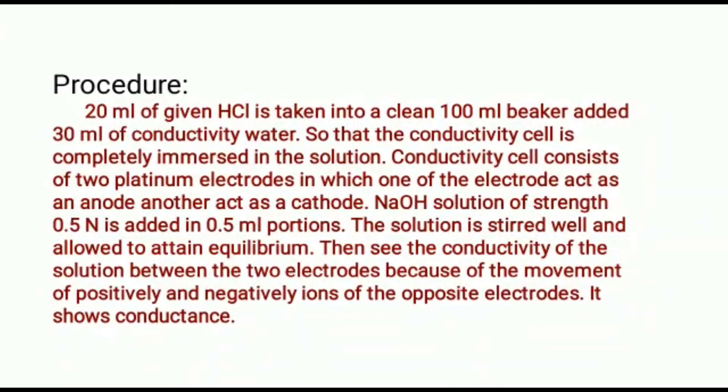The given hydrochloric acid is transferred into a 100 ml standard flask and the solution is made up to the mark using distilled water. Then 20 ml of the hydrochloric acid is taken in a clean 100 ml beaker and 30 ml of conductivity water is added, so that the conductivity cell is completely immersed in the solution.